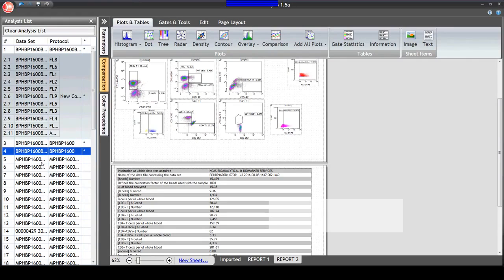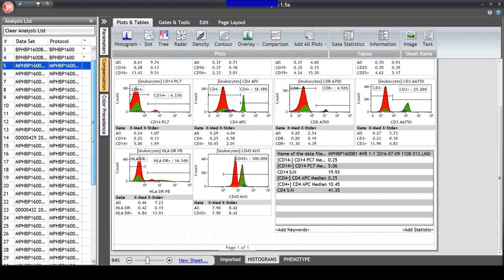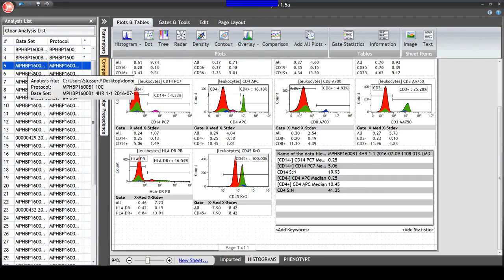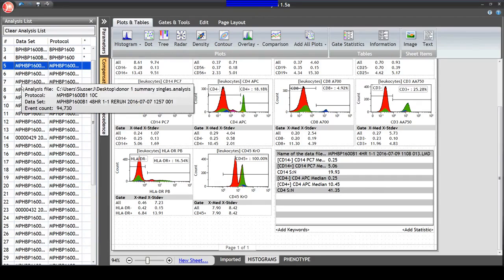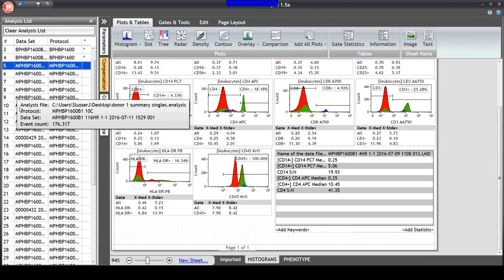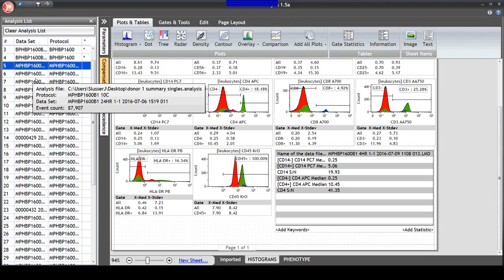Now, I have multiple data sets over multiple times on multiple tubes. How do you handle that? Okay, so I'm going to scroll down just a little bit. All of these data sets are just the EDTA collection over a period of time. My 4-hour, my 24-hour, my 48-hour, 96-hour, 116 hours, 192 hours, 240 hours. That's just the EDTA on an individual number 1.